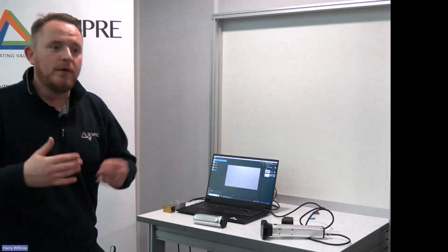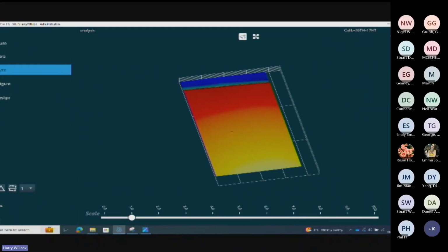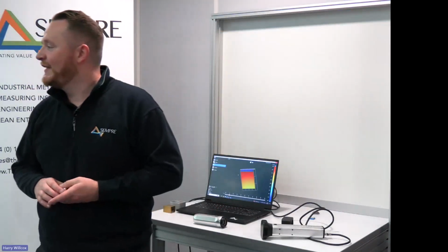It's not particularly difficult, if I'm honest, the stitching of those two together, and I'm happy to run through the principle of how it works. It probably wouldn't be today. To export the STL file is within the software. If we go to one of our scans, so if you look at our roughness, I can literally just click export STL, and that's the export for me. Okay. Hopefully that answers it. Might not have done, but fire away if you need to.